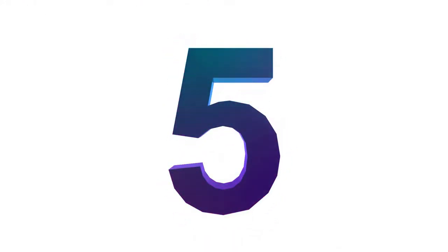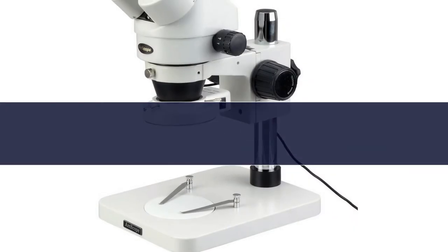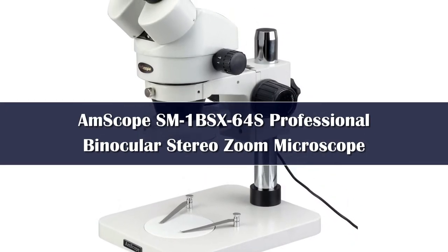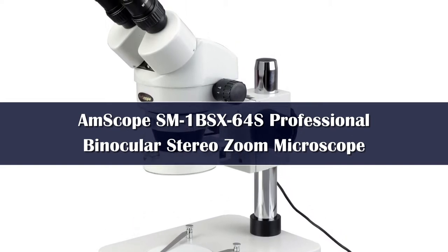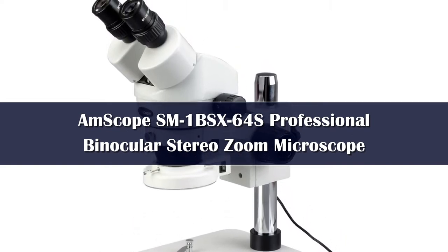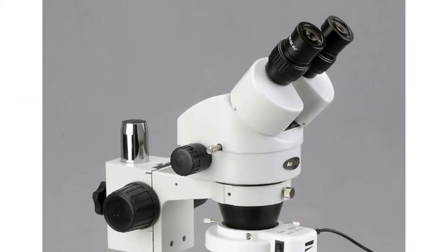Number 5. For the most part, stereo binocular microscopes are the most common and easiest to use. Some of them come with eye guards and some don't, like this model from Amscope. Without the guards, you do have to hover slightly over the lens to get a clear image.